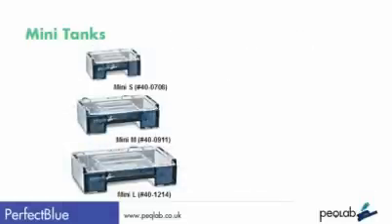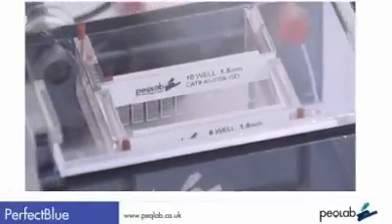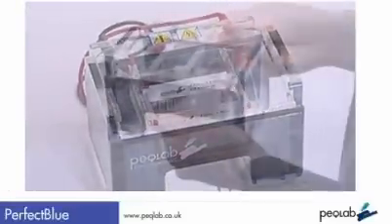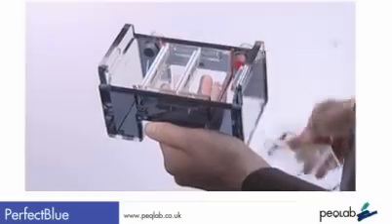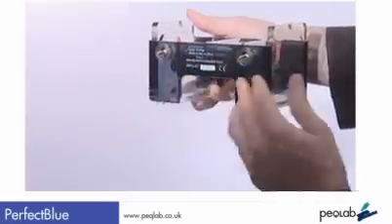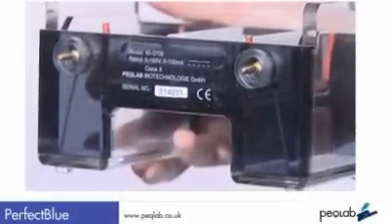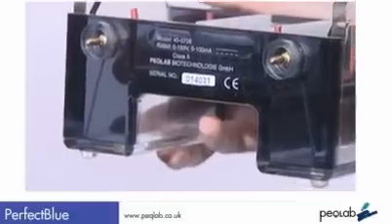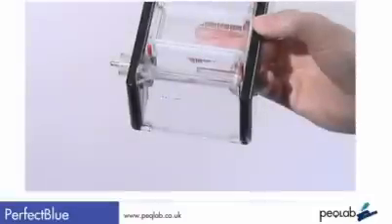PECLAB's Perfect Blue mini tanks. Starting with basics, these tanks are CNC milled, not injection moulded, for a strong, sturdy design. Looking around the back, we see gold-plated banana plugs for a reliable and safe connection, corrosion-protected electrode junctions, and to avoid damaging the platinum wire, the anode and cathodes are sealed into the system, not loose.